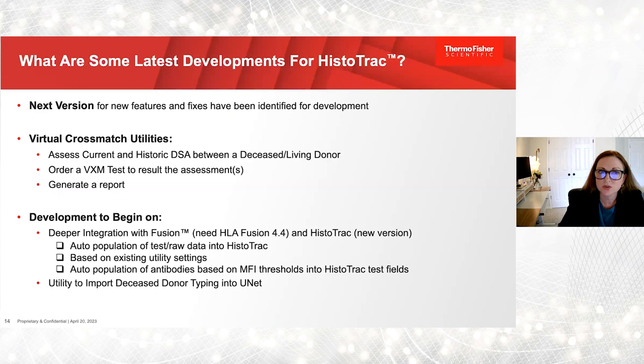So from within HistoTrac, what are some of the latest developments? We have started on a new version of the software. The new features, fixes, and enhancements have been identified, and they're being organized and agreed upon for development to start taking action.